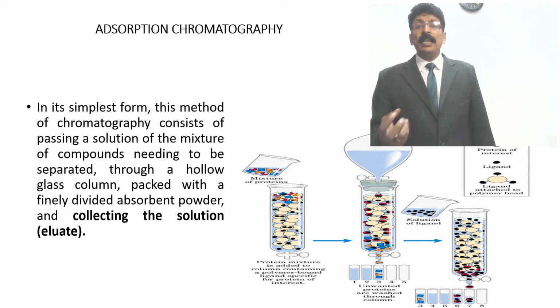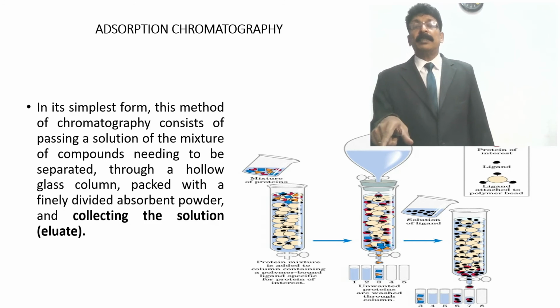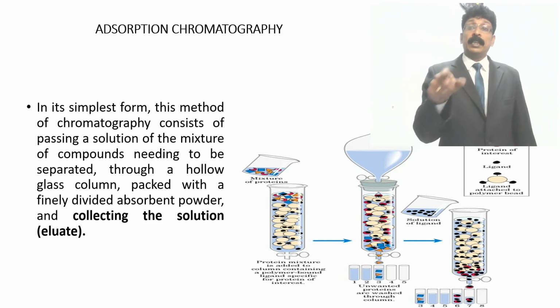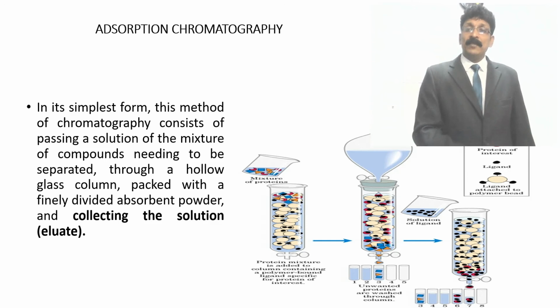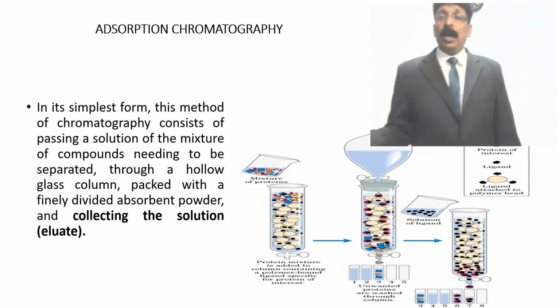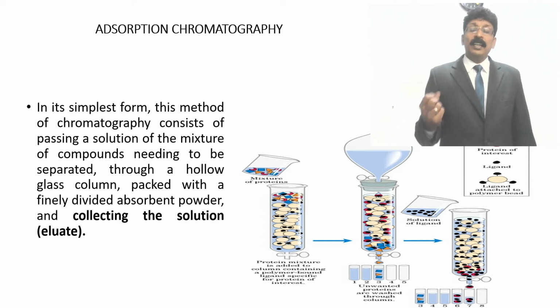So you are changing the solvent system, so that you are separating a mixture of compounds. Initially it was a mixture. The red color was along with the orange and also the blue color. But the orange and the blue are separated initially because they were not held. They have no affinity towards the ligand which you have added. So one which has attraction towards the ligand will be held there, and one which has more affinity will stay for a longer time, and then it can be separated.